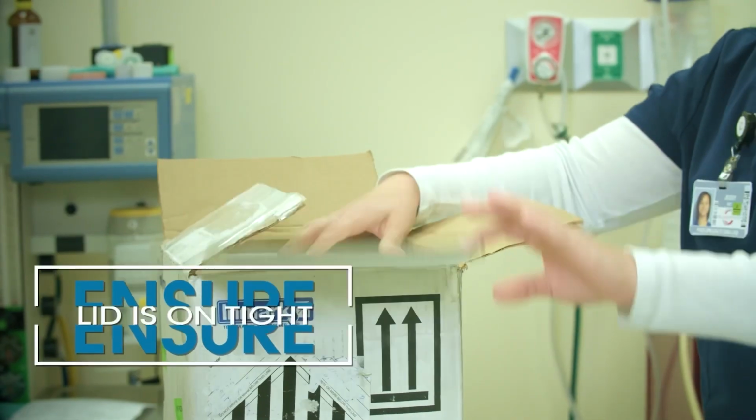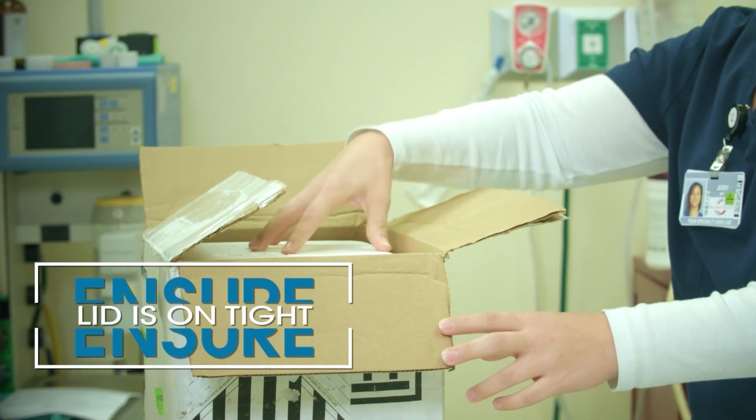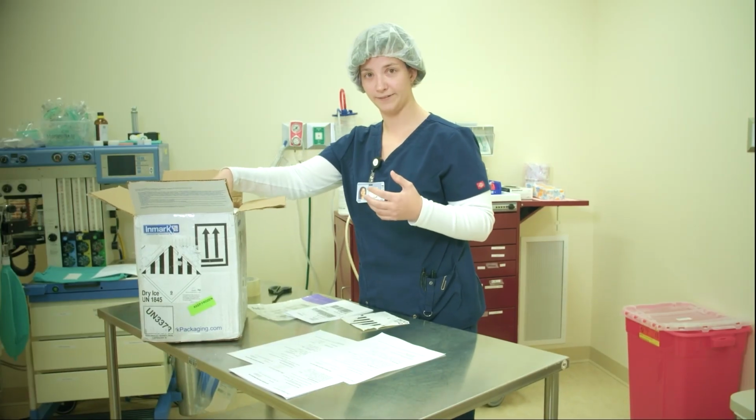Close the styrofoam box. Make sure the lid is on tight. Sometimes dry ice can get stuck between the box and the lid, not creating a good seal. So make sure it's on there tight.